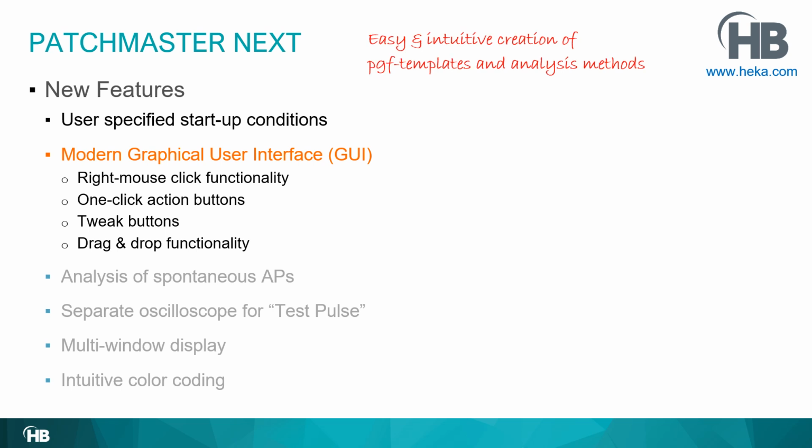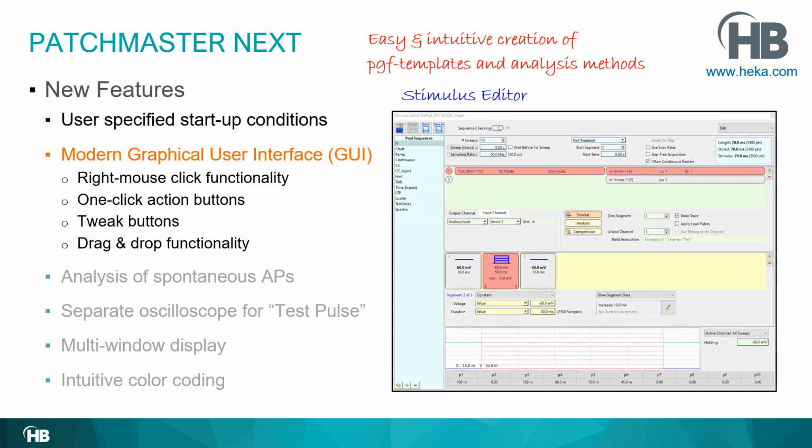There are other windows that I just quickly would like to show. For example, the stimulus editor and the analysis method, and the analysis editor. Here, the stimulus editor, again, it's very straightforward. I don't explain all the details.